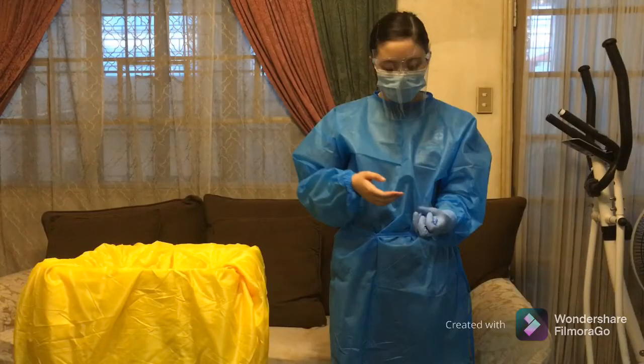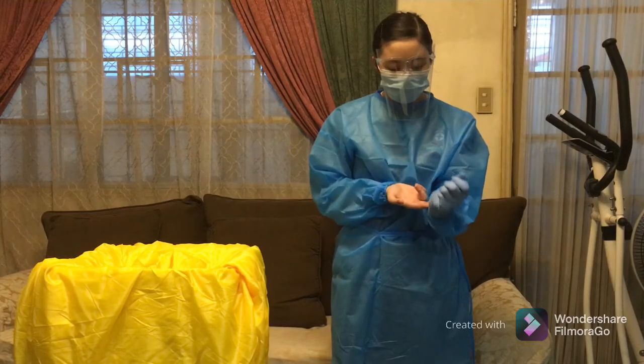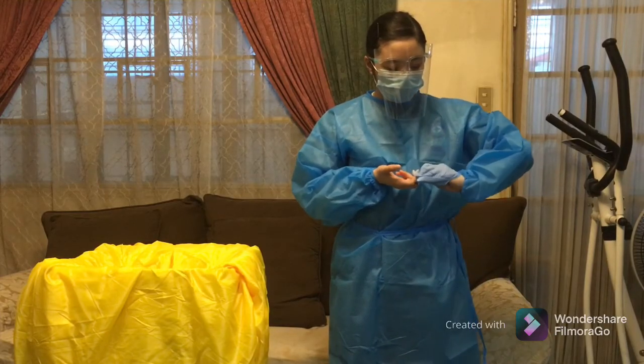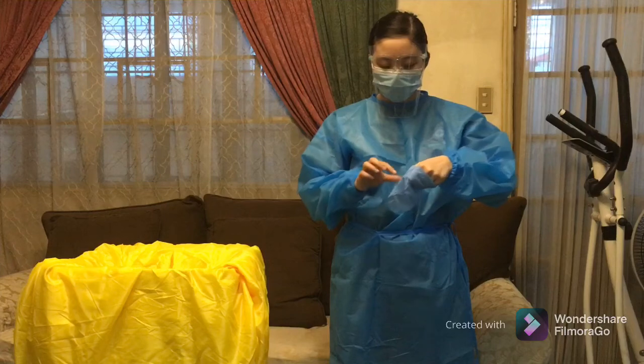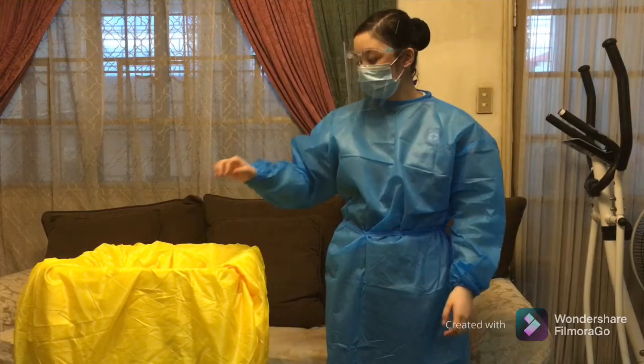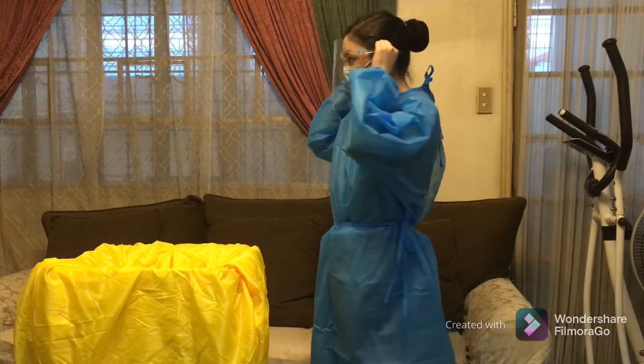Doffing of PPE. Doffing of gloves — remove soiled gloves by grasping it on its palmar surface. Pull the first glove by inverting it or rolling the glove inside out. Continue to hold on to the inverted glove by the fingers of the remaining gloved hand. Slide two fingers of the bare hand under the gloved hand. Pull the second glove by turning it inside out, ensuring that the first glove removed is inside the second inverted glove. Dispose the gloves into proper receptacles.